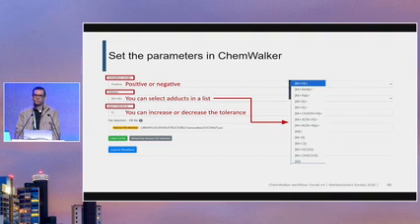Okay, so it is a similar answer, but initially you do that by trial and error. For example, that one is kind of a high threshold, 50,000. It was a really specific case because one of the drugs was actually detected on many samples at a higher threshold than expected, and because we knew that information, we could use it for the example. But usually you're going to set it at 0 and see whatever appears.